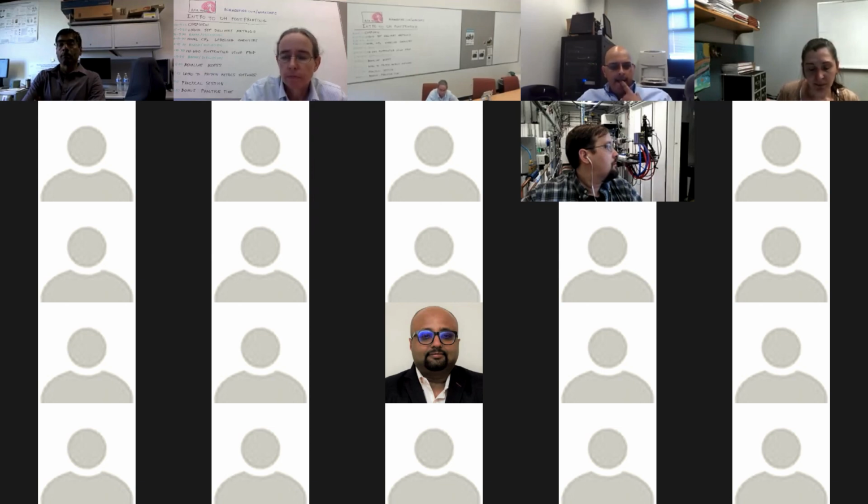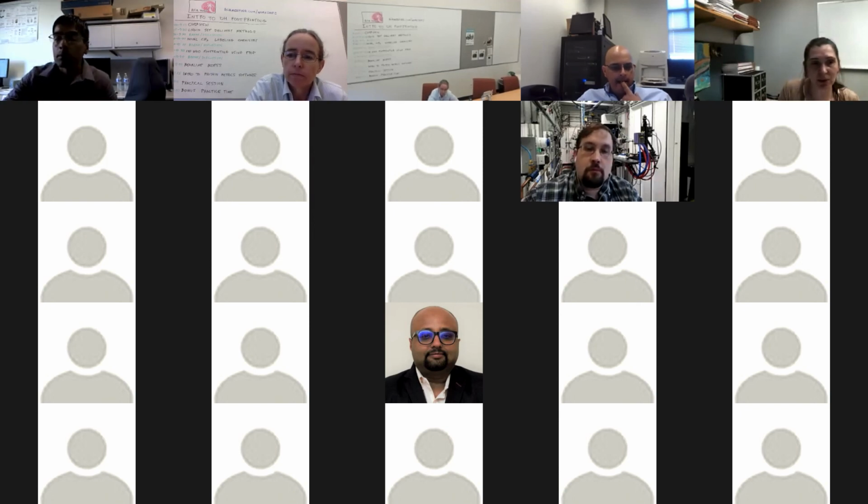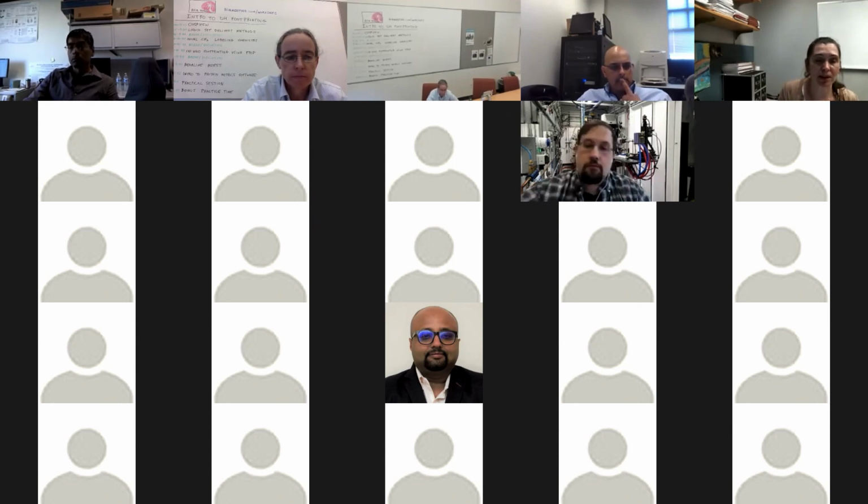Okay. Yeah, thank you. And again, the chemistry might be slightly different, so we don't know yet. We're trying to learn about the differences in chemistry, how we label with CF3 and OH at the same time, because we see different patterns, obviously. We need to make sure how we're going to titrate this chemistry as well to see different modifications. So this is still an open question, and we're still learning this.